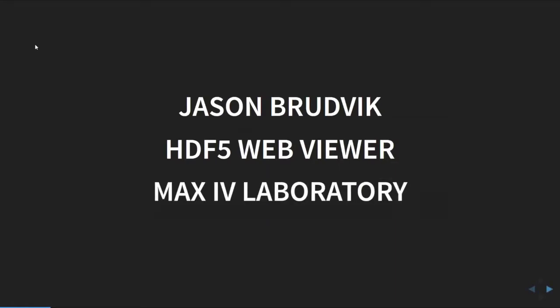My name is Jason Brudvik, and I'm going to tell you today about our method for viewing data in a web browser, which we have unimaginatively referred to as the HDF5 web viewer at the MAX IV laboratory.